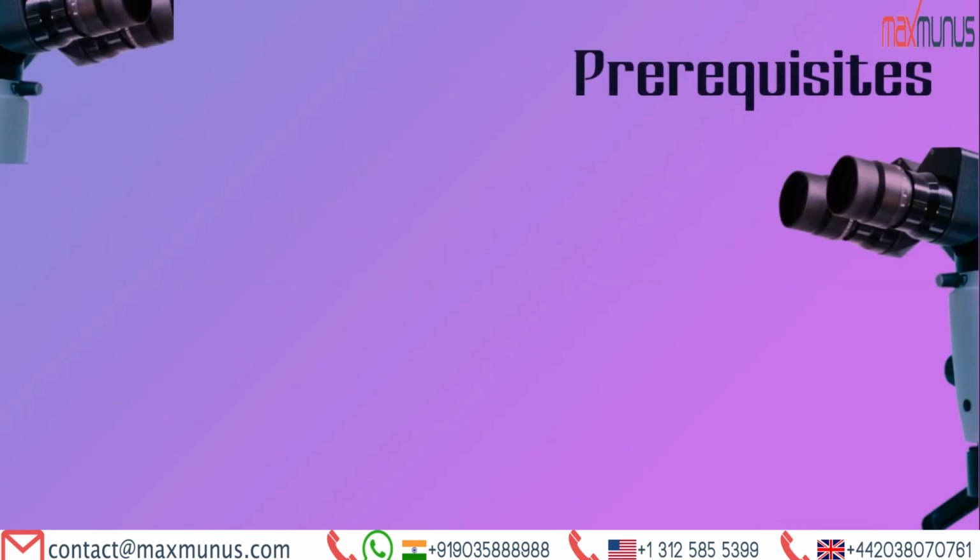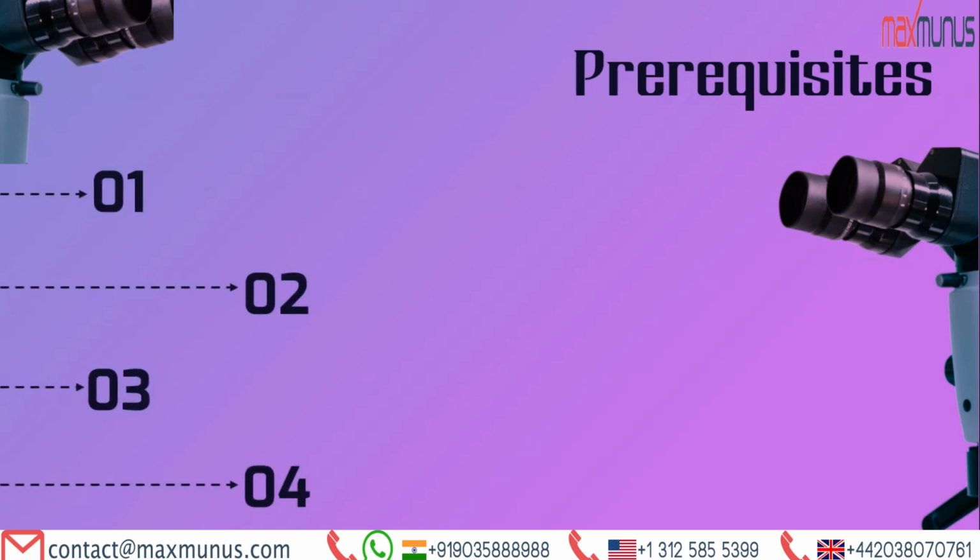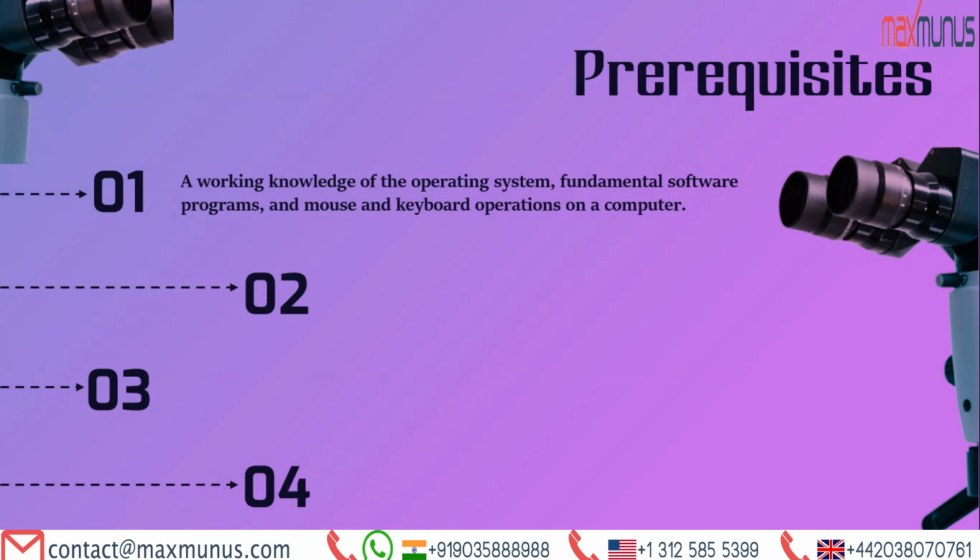Here are the details of the prerequisites, that is, who is eligible for this Labware LIMS learning session. A working knowledge of the operating system, fundamental software programs, and mouse and keyboard operations on a computer.